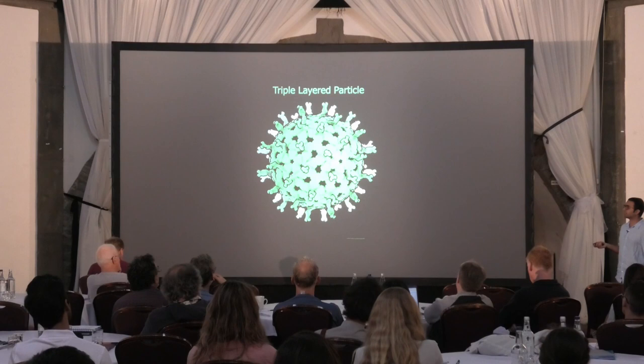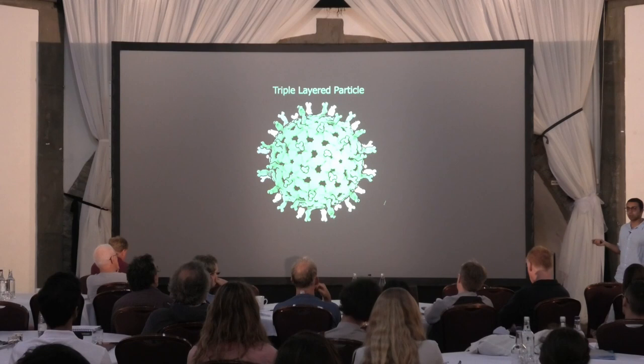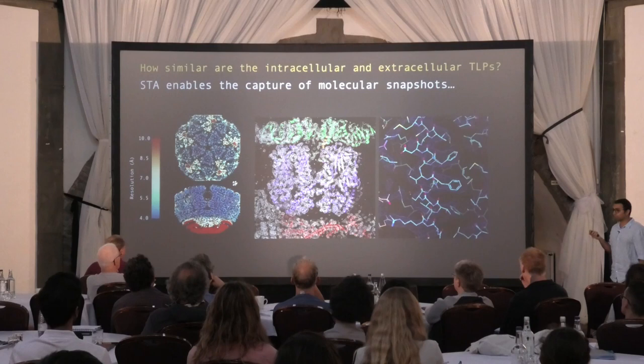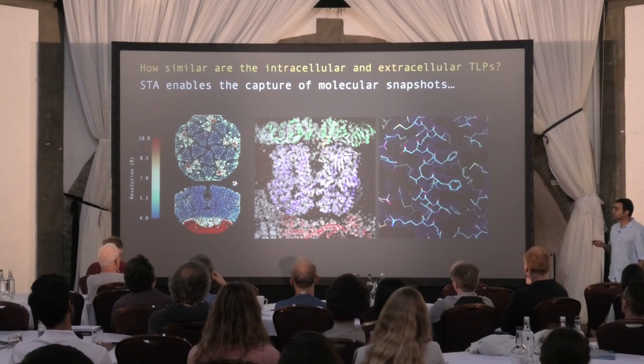to activate the virus. So the only high resolution structures that we have up until now are of chymotrypsin or trypsin digested variants, but not of the, you know, intracellular form. So, because we did subtomogram averaging, we got a pretty high resolution for this species because they were the most representative in the data sets that I collected.